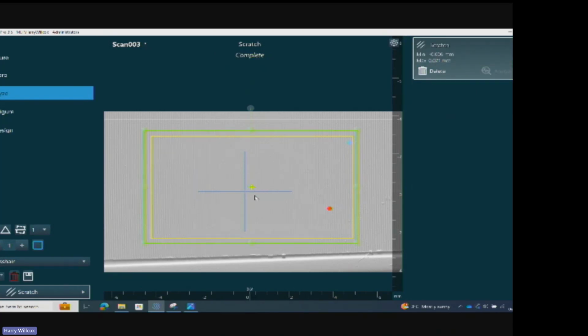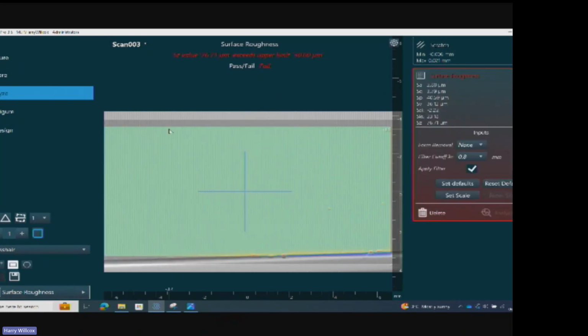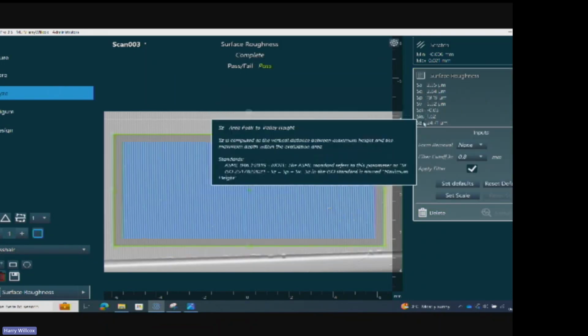You can see the minimum is in the center point, which is what I'd expect on a roughness standard, because they naturally sort of move. And then we've got the high point here, which is 21 microns tall. So in essence, there's 27 microns of deviation on that surface. We can also use roughness parameters to make assumptions about a surface. If we were to define a boundary, say, over this roughness standard, we've got a routine called SZ.